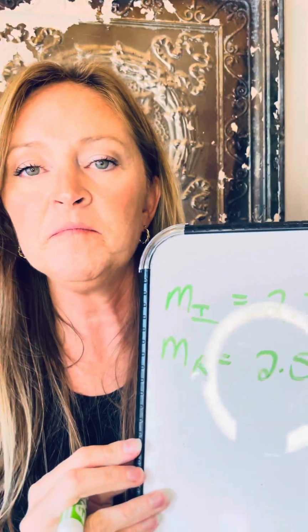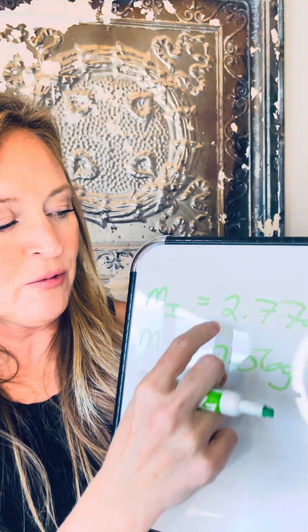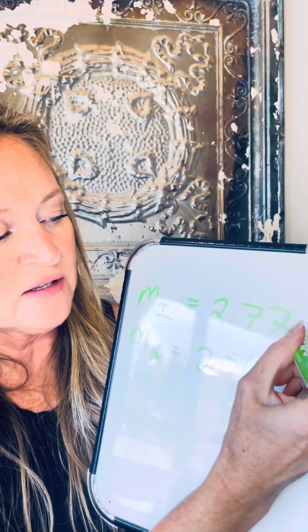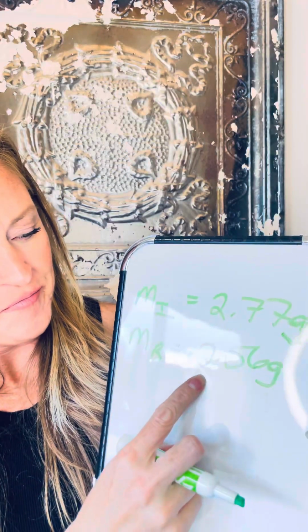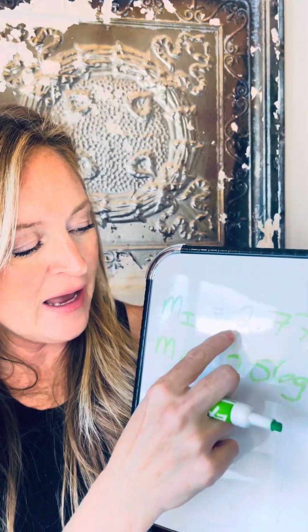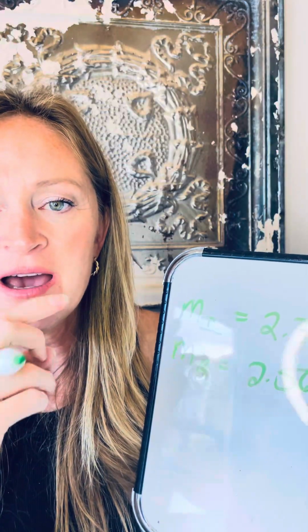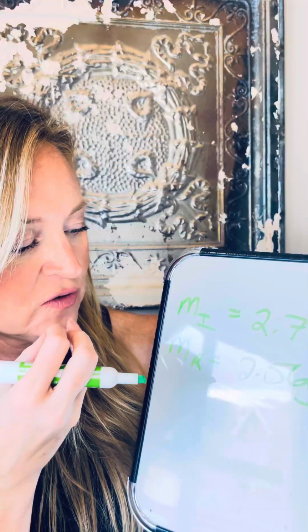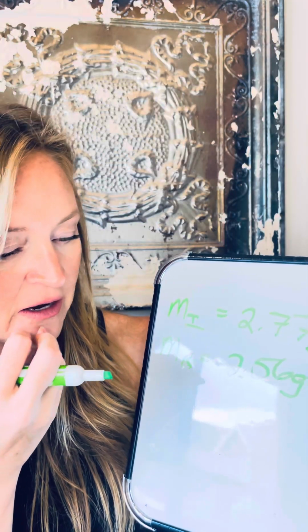Was I close to recovering all of it? Yeah, right? Was I 100%? Did I recover all of it? No, right? That would have been 2.77 grams. This is a G. I definitely got pretty close, right? I would be pretty proud of this. My guess is I'm going to be in the high 80s, low 90s as far as percentages. I came up with most of it, it seems like. I recovered most of it.